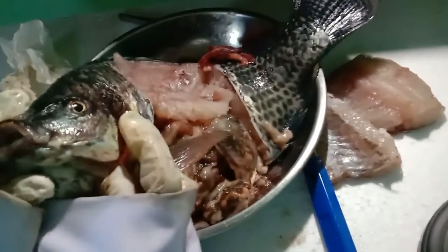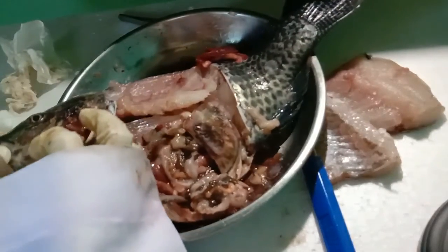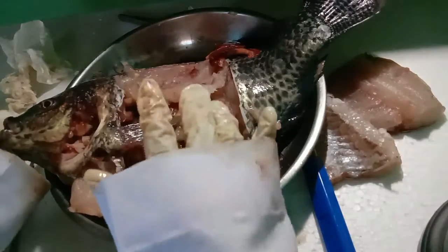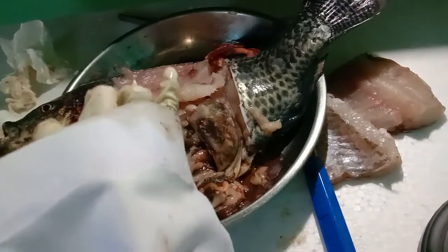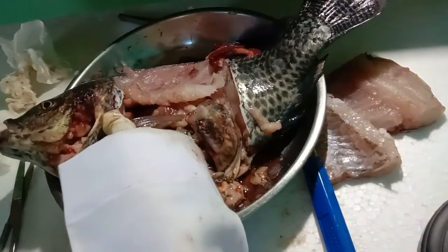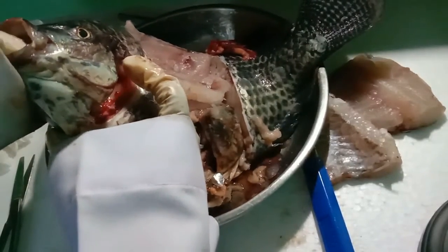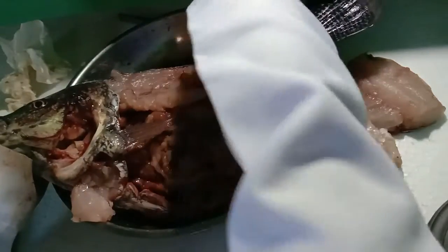Here is the closing of the mouth, which can change the pressure inside the buccal cavity. The floor of the mouth can move up and down to increase the pressure and force the water down through the gills. Here are the gills. I cut it.